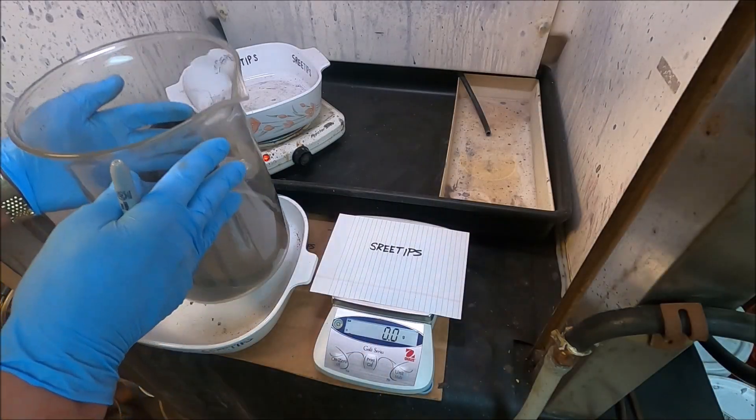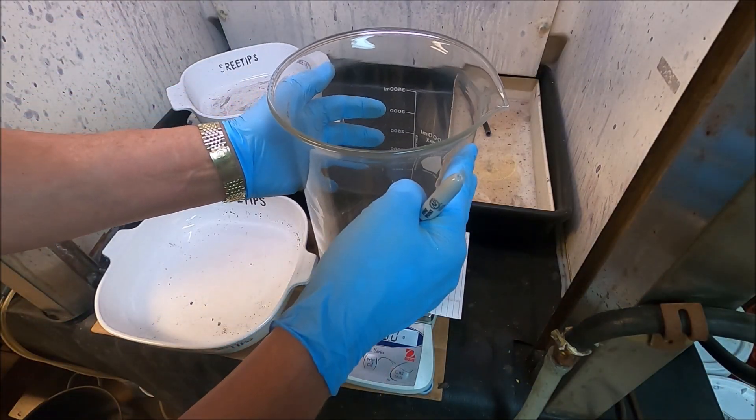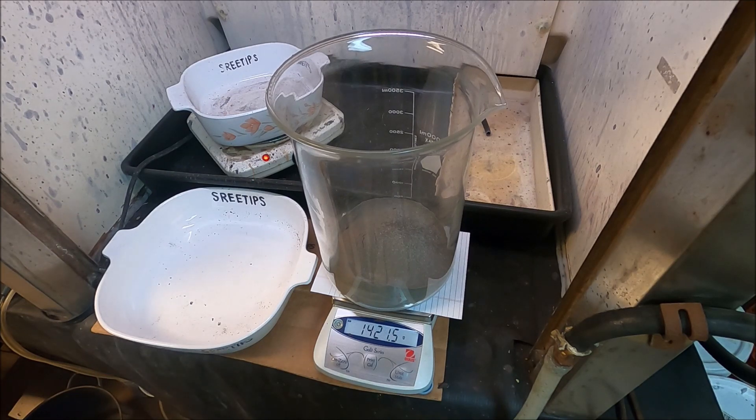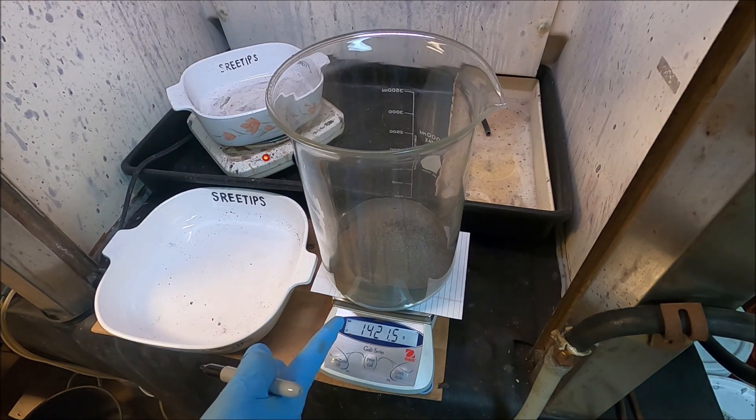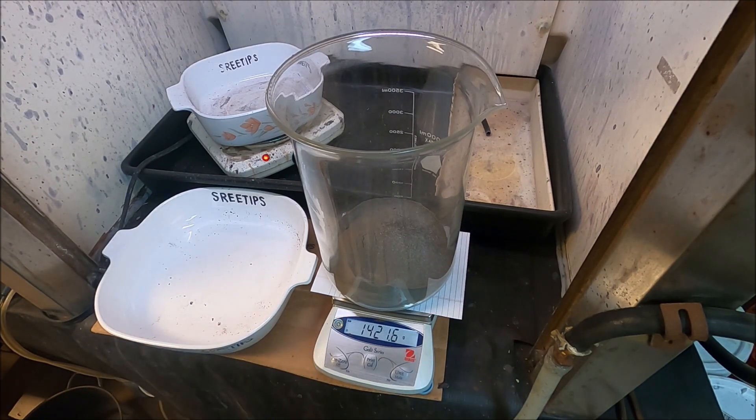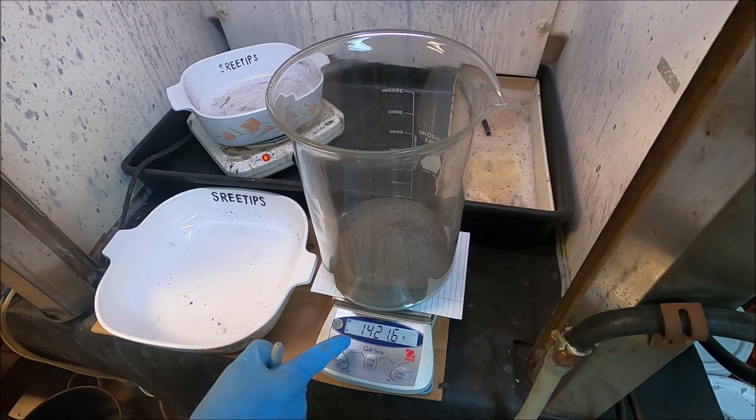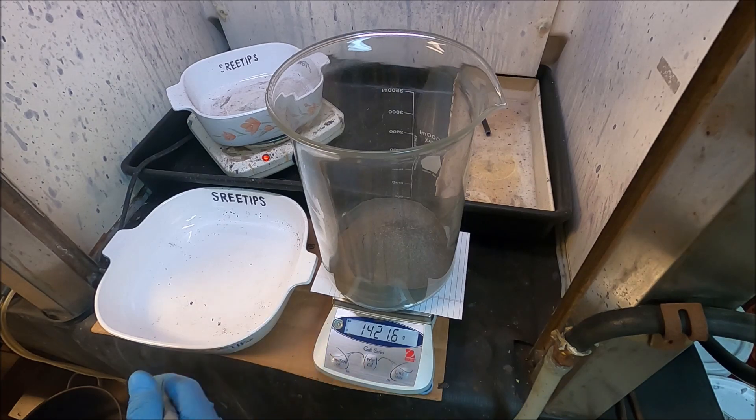So now what I'm going to do is just weigh the beaker with the material in it and record that weight. And then when we get everything out of there we'll weigh the beaker by itself and we'll be able to calculate the yield. 1,421.6 grams.